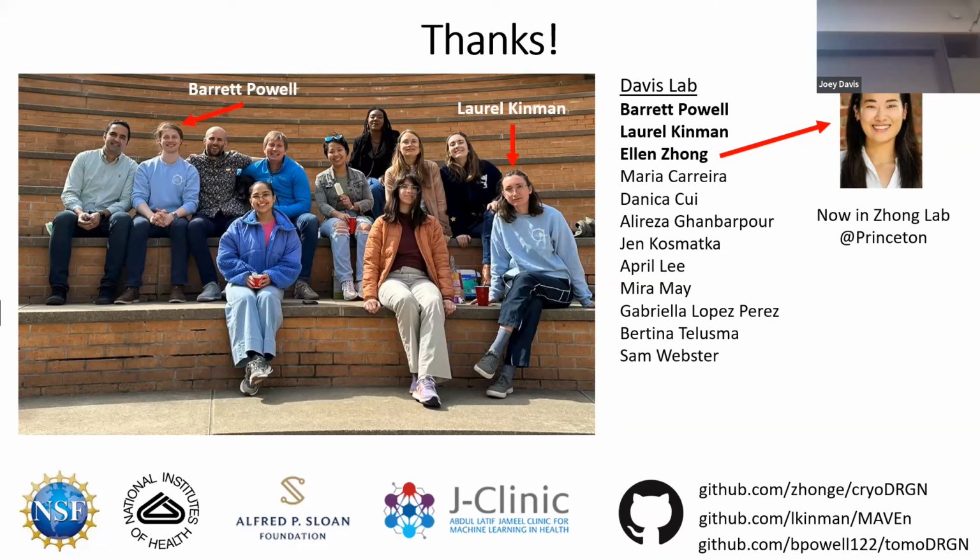No, but I'll just say, I think the way this is going to go is that those types of instruments will end up in national centers. And then you'll be able to send some cellular samples and some condition you care about. They'll be able to collect a few hundred tilt series, like 1,000 tilt series for you. And that's just going to proportionally push the particle count down in terms of the lower bound of abundance. But right now, it's great for ribosomes. We happen to work on ribosomes. We think it's a well-matched system.